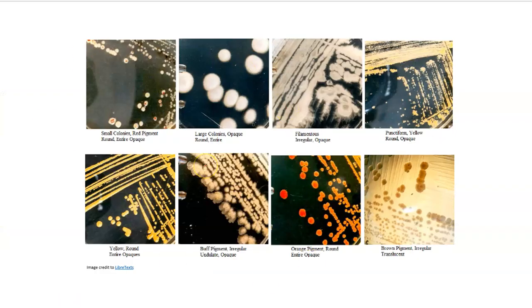This image shows you the various different types of colonies that bacteria can form, so I think it's good to look and try to identify them based on the terms used in the prior chart. So for example, here we have these very small punctiform colonies that are yellow, round, and opaque in color.